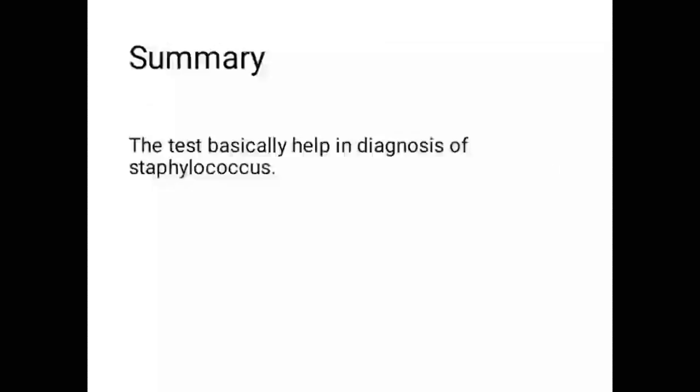The basic summary of the catalase test is that the test basically helps in the diagnosis of Staphylococcus. Because Staphylococcus bacteria are catalase positive, whereas Streptococcus are catalase negative, it helps in the diagnosis of Staphylococcus bacteria.